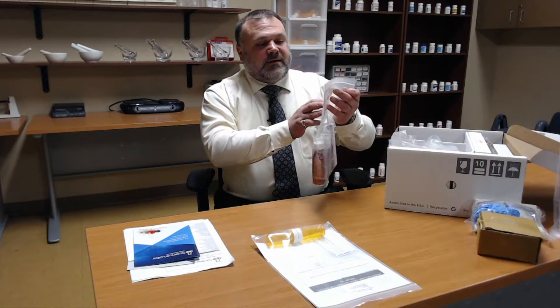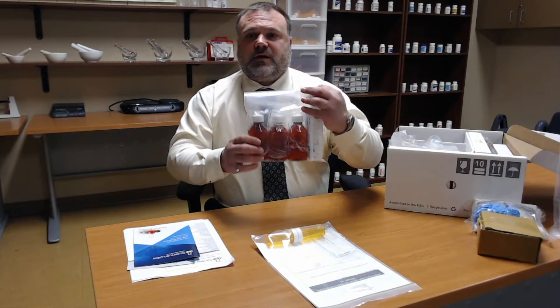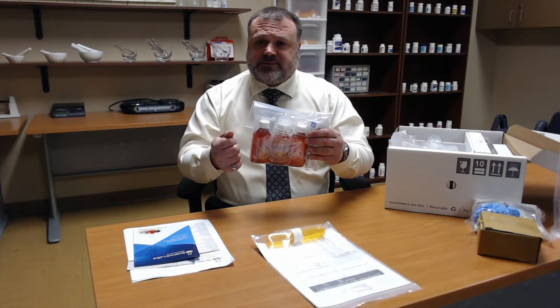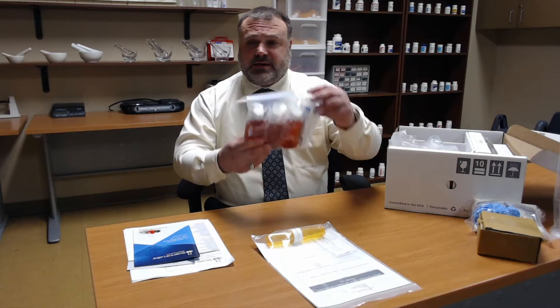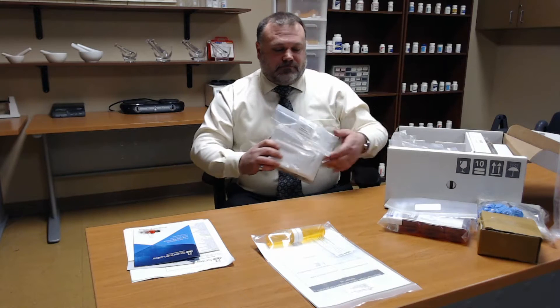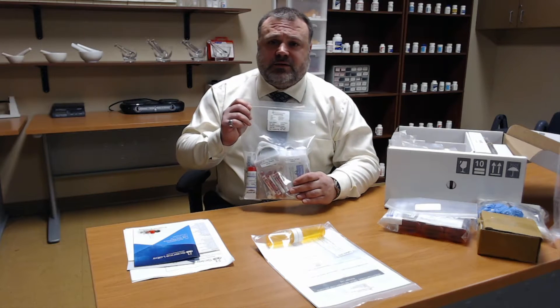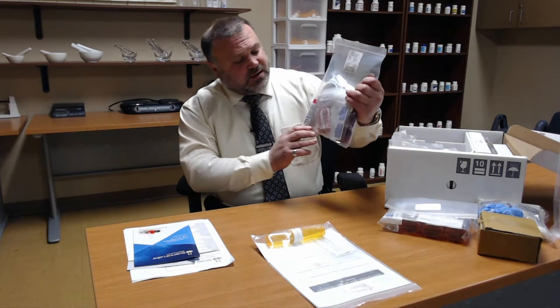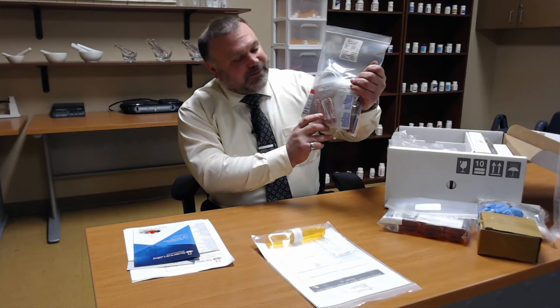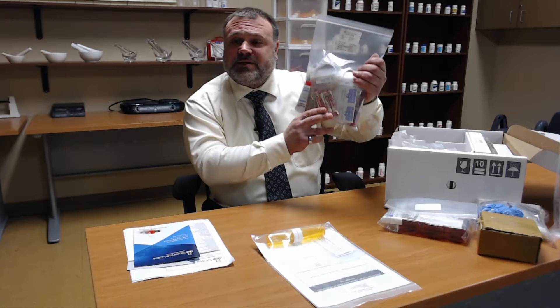We have the measurement lab. You can see it comes with three bottles for various liquids. You will be making solutions, suspensions, and emulsions during the various labs. This is the compounding kit. There are various other compounds you will make including ointments and creams. You can see it has Smarties — we cannot give you real medications so we're going to be utilizing placebos, which include Smarties and placebo tablets as well.